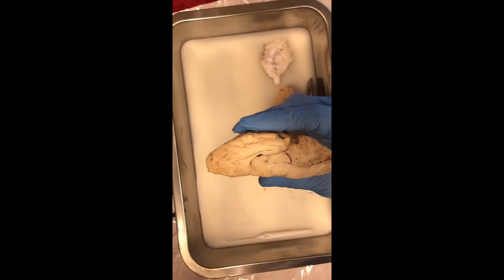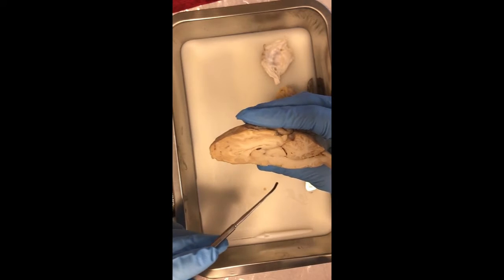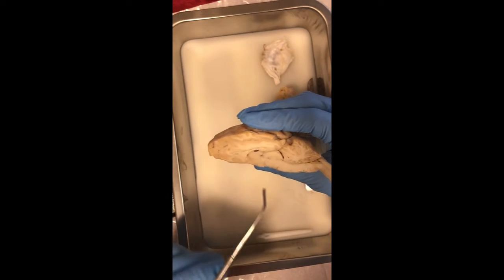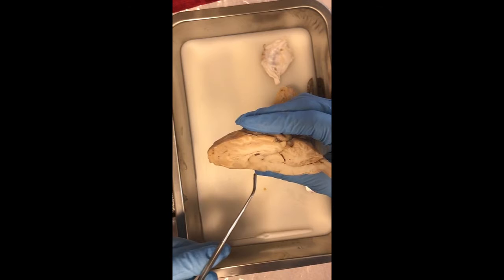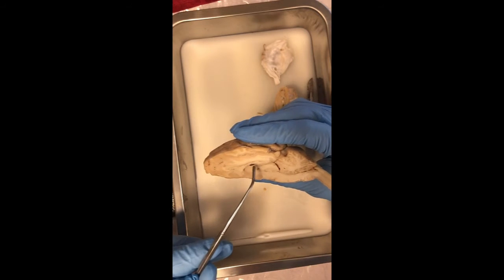So after the mid-sagittal section, first off, the corpus callosum is located right here. The thalamus is here, and then the hypothalamus is located below it, about right here. The lateral ventricle is this slit right here.